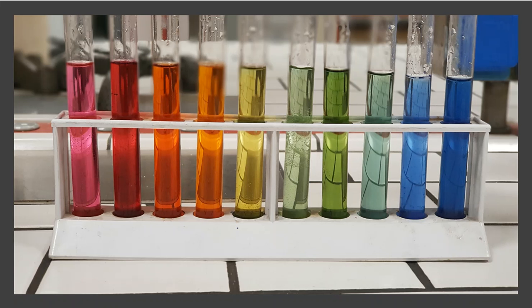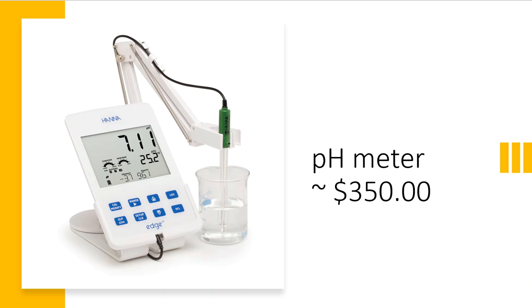Well, as you can imagine, this is not the best way to detect pH, especially if we need a concrete value. So we do have things called pH meters in the lab as well. The problem with these is that it requires a little bit of training.